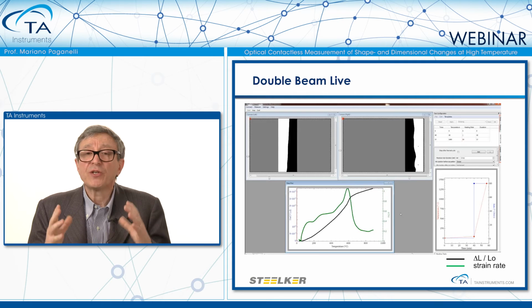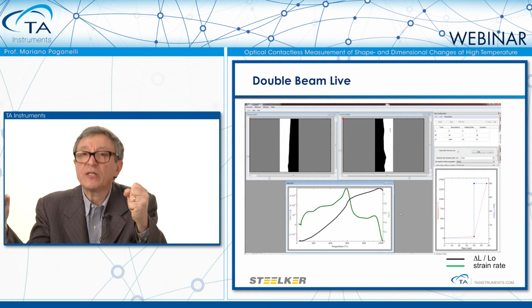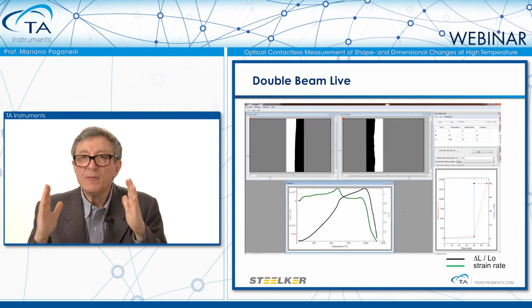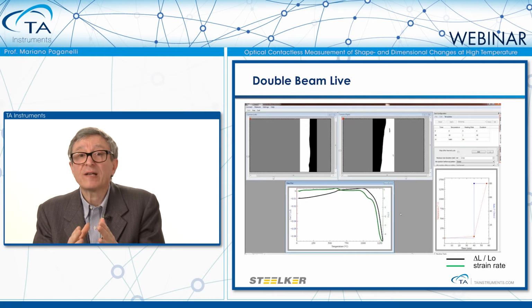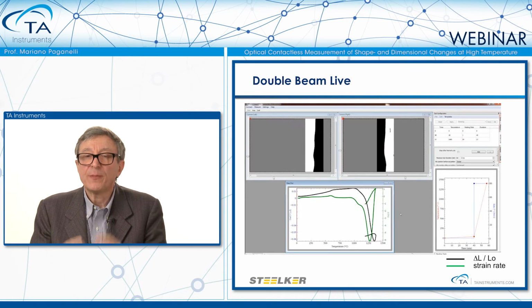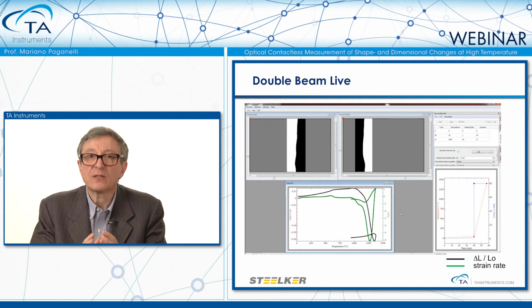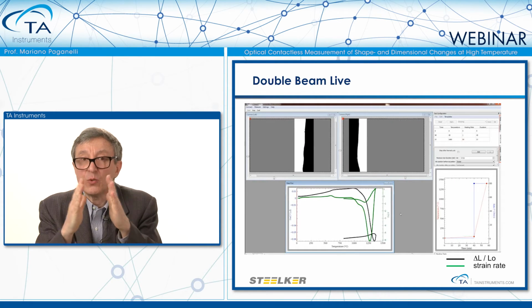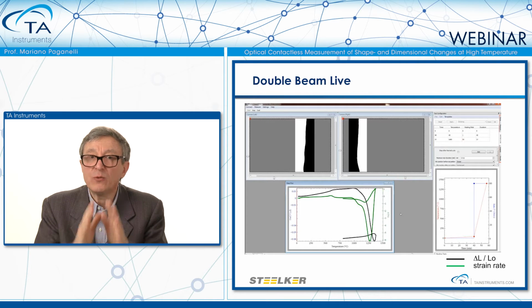Rising the temperature, we reach the point where the glassy phase starts developing and starts pulling the particles together. Then a fast shrinkage starts happening, and the two images start moving toward the center. This process is very fast simply because here we are applying a very quick heat treatment, 80 degrees per minute. Once it reaches the minimum dimension, the process inverses. The material starts swelling, the dimension starts growing. Then entering into the cooling, the two lines start closing again toward the center, reducing the size again. So it's very complex, and there is no other machine that can show you exactly what is happening.